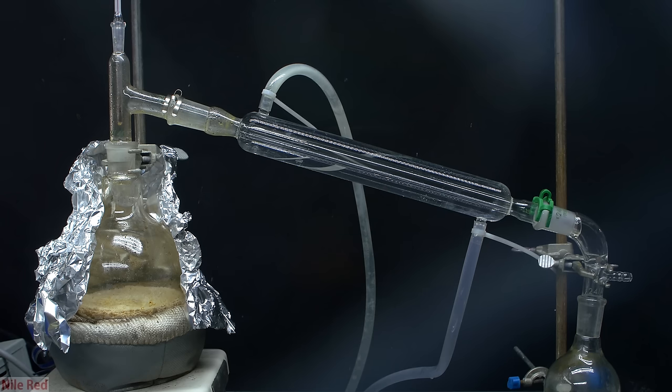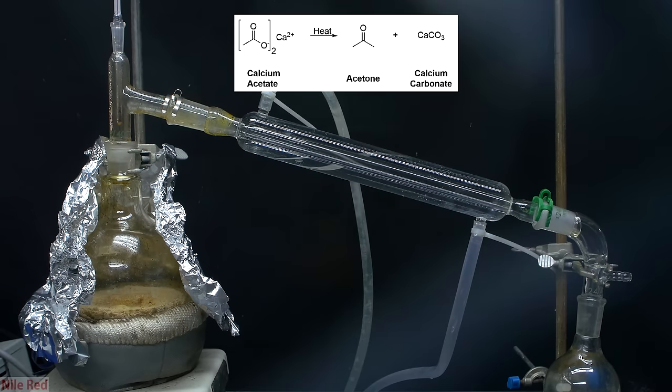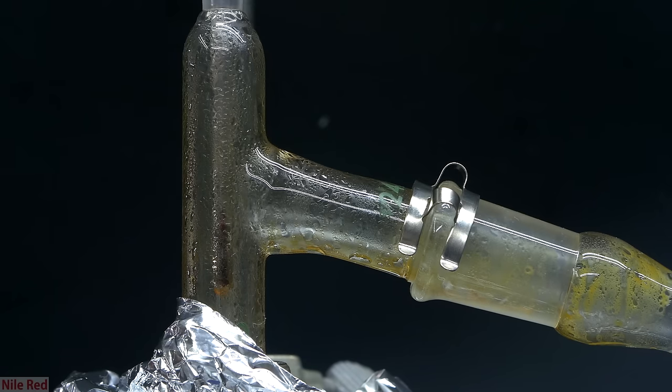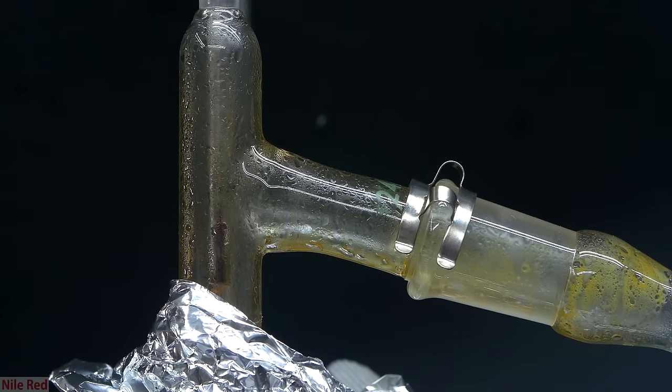In theory, what should be happening is the calcium acetate is breaking down into calcium carbonate, which is a solid, and acetone, which can be distilled off. Unfortunately, some side reactions are occurring and they give the distillate this yellow color and a very weird smell. I'm really not sure what's giving it the color or the smell, but if you guys have any idea, I'd love to hear it in the comments. Unfortunately, I don't think I've really smelled anything like it before, so I can't really give an example or an idea of what it really does smell like.